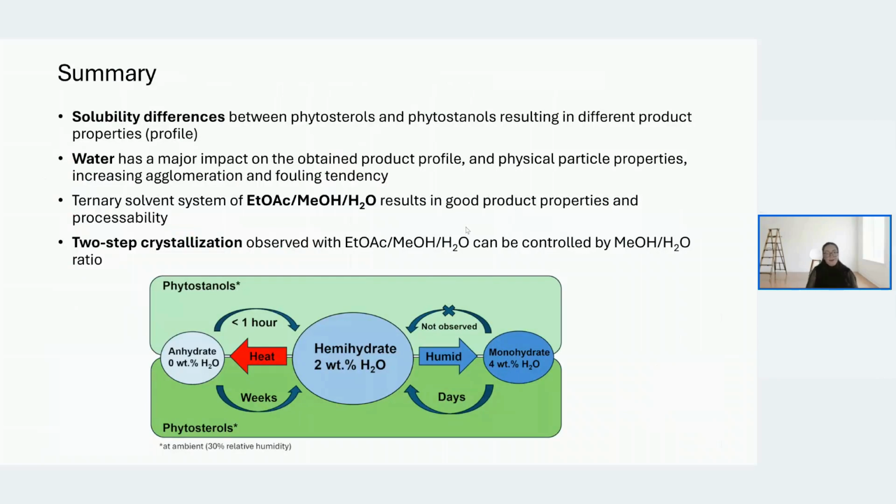And shortly about the presentation still, so practically solubility differences between sterols and stanols result in different product properties. And especially we are interested in this sterol-stanol ratio. Water, we noticed that it has a major impact on the obtained product profile, but also on the physical particle properties. So practically it increases agglomeration and fouling tendency. And that makes the upscaling extremely challenging, unfortunately.